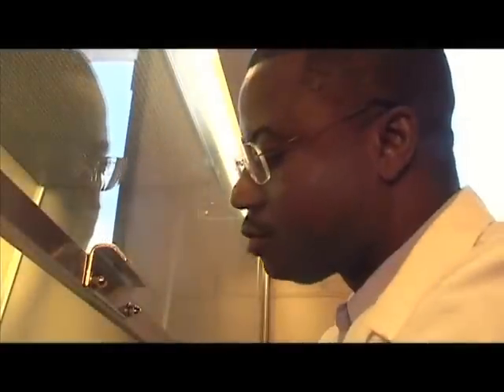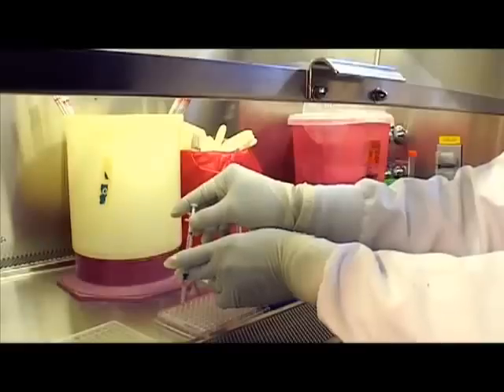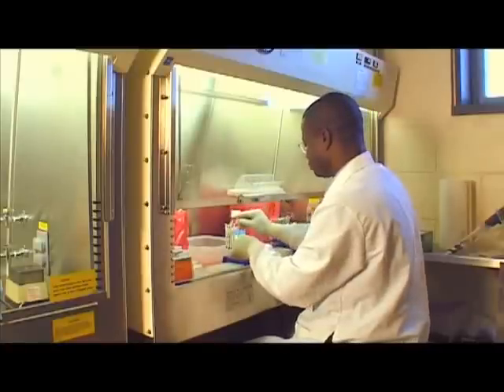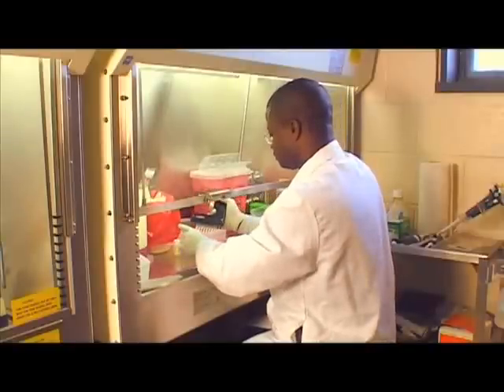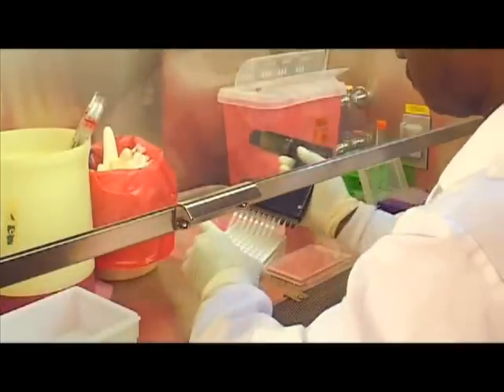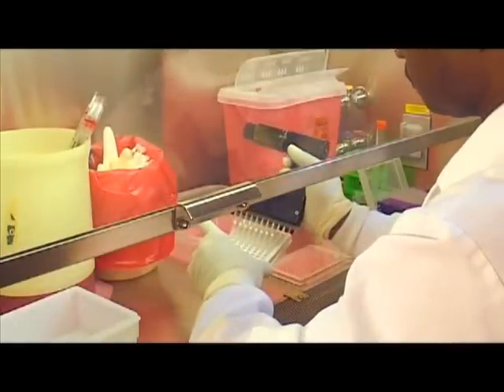So for this we used real strains of virus, blood inside syringes. The syringes were stored with infected blood for periods from 1 day to 6 weeks at room temperature. And then we introduced what was inside the syringes into culture that contained the uninfected blood cells that the virus would encounter if it were injected intravenously. And after 3 weeks in culture, we could see which syringes contained viable virus and which did not.